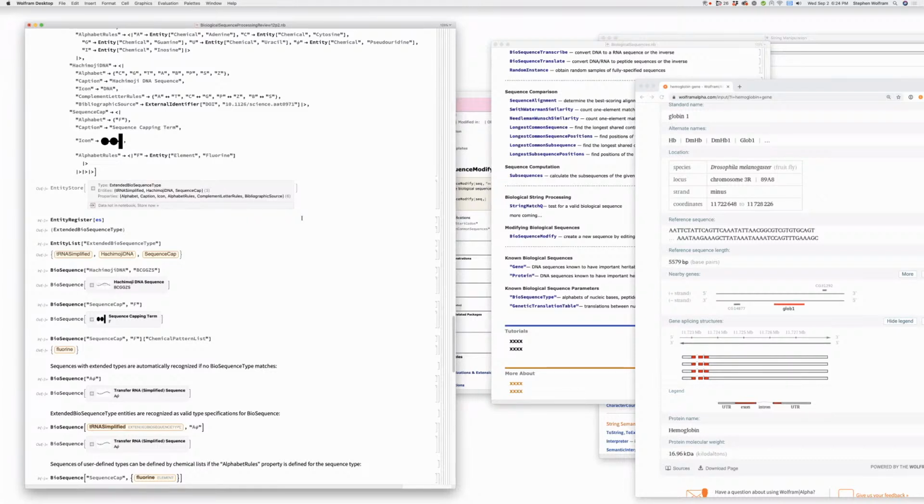I see. But if I take my mitochondrion and I just import it, I've got the FASTA file, and then you want to map it against the reference. There's a function that's not going to make this release called locate BioSequence, where it figures out where it is on the genome and assigns the strand and the positions and all that good stuff. But we have already genome lookup, right? Right. So you can do that too.